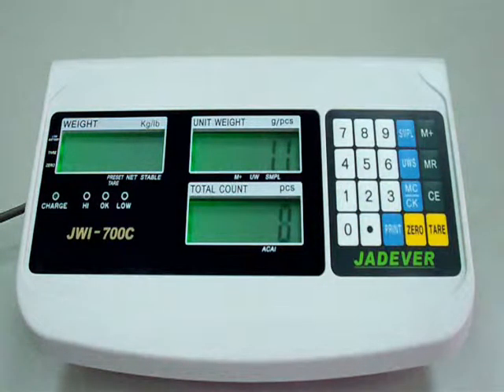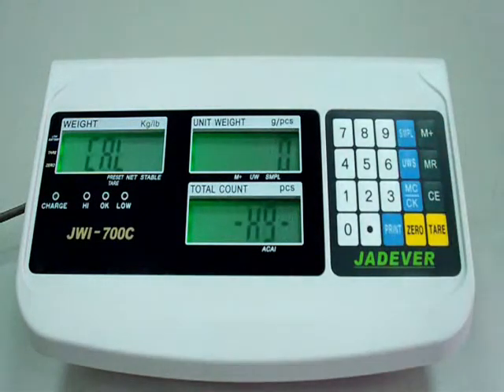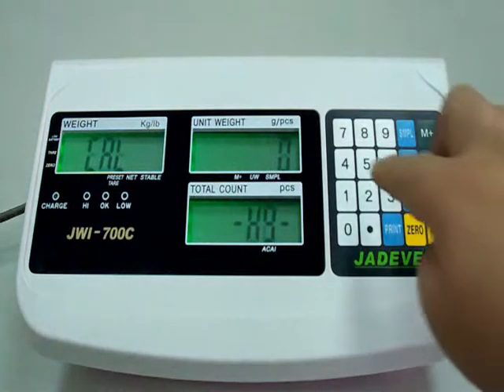Again press key sample to enter the zero point calibration mode with zero flashing. Wait till zero is stable, then key in the calibration value: one third of full load.